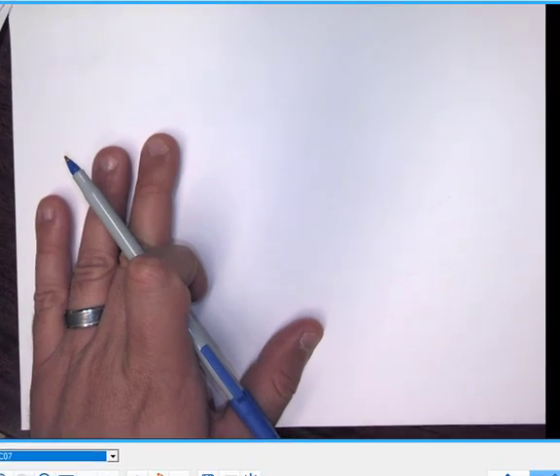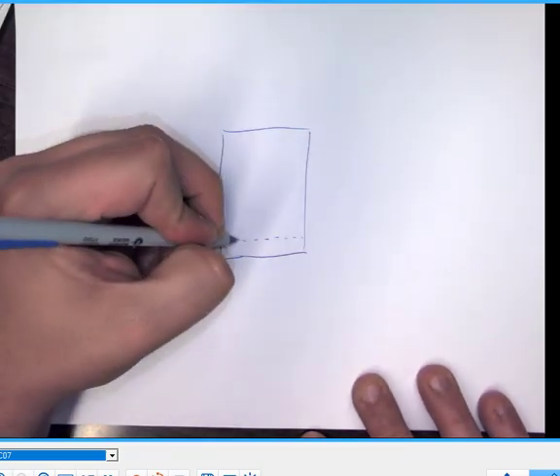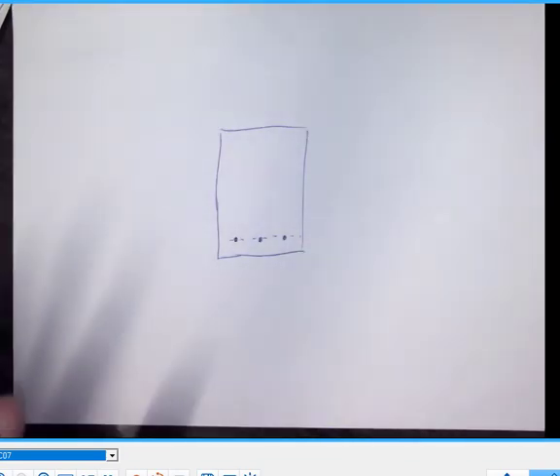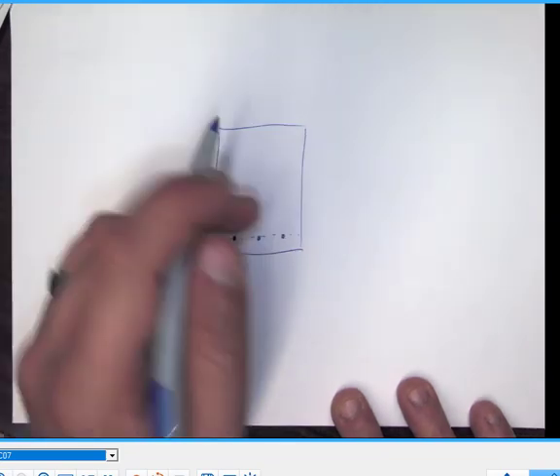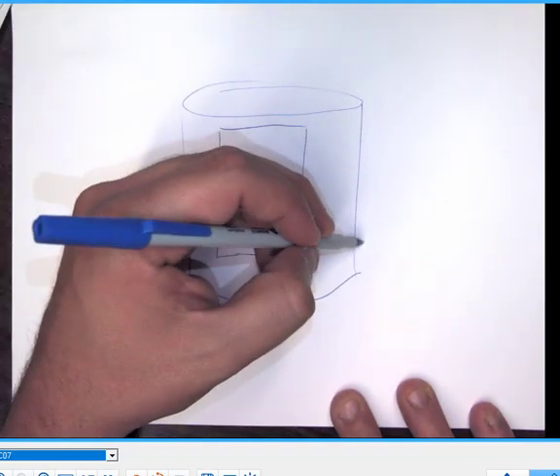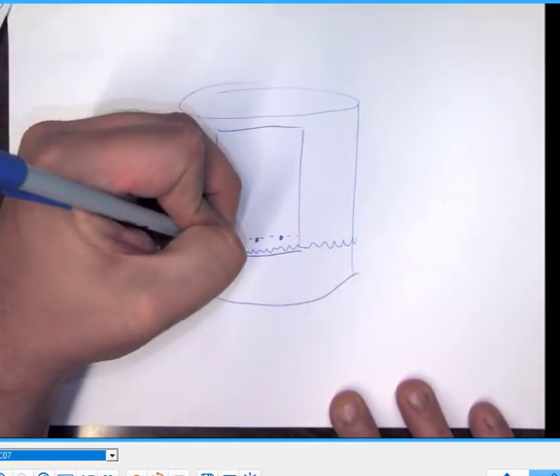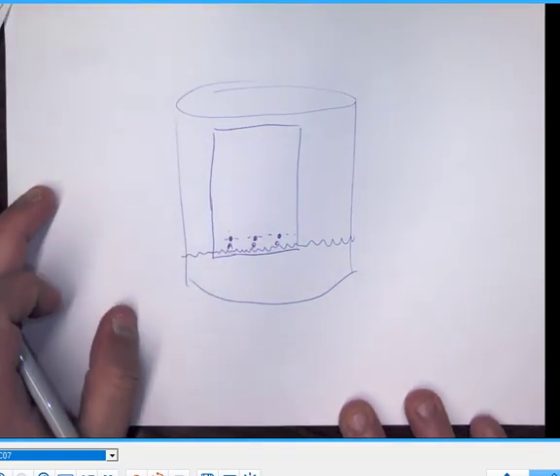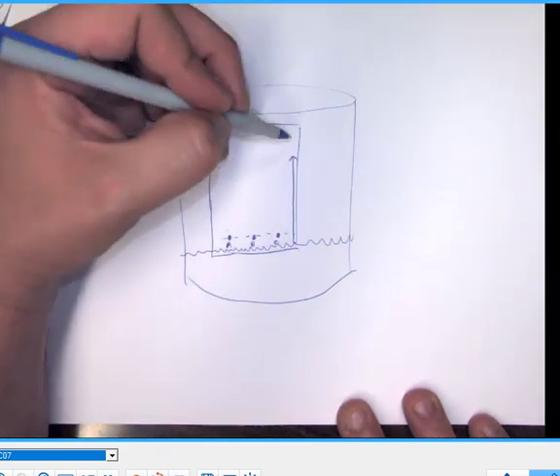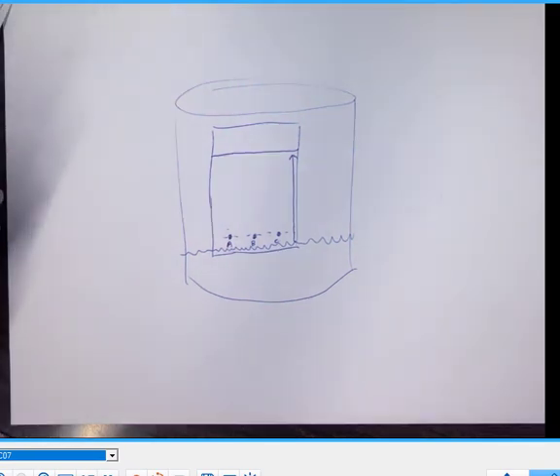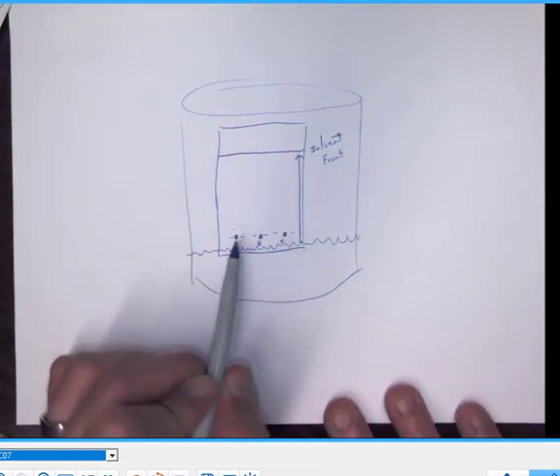You'll have a TLC plate like this, and you're going to put one, two, three — however many spots on there. You'll have three different plates to work with. You put the plate into a TLC chamber, which is just a big jar with solvent in it. You want to make sure the solvent just touches the plate but doesn't touch your compounds. Over time, the solvent front will migrate up the plate, and you want to stop it usually two to three centimeters before it reaches the very top.